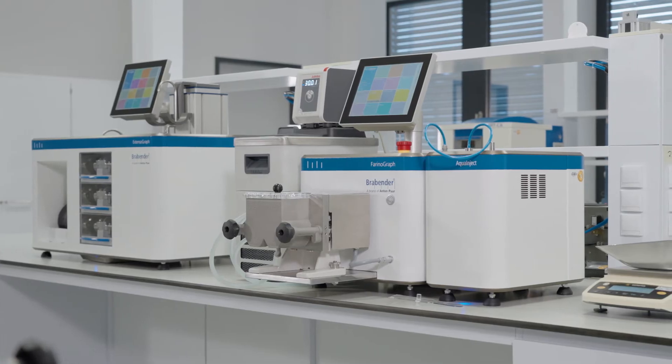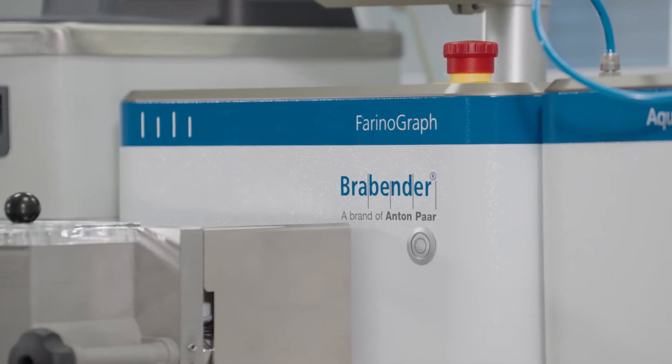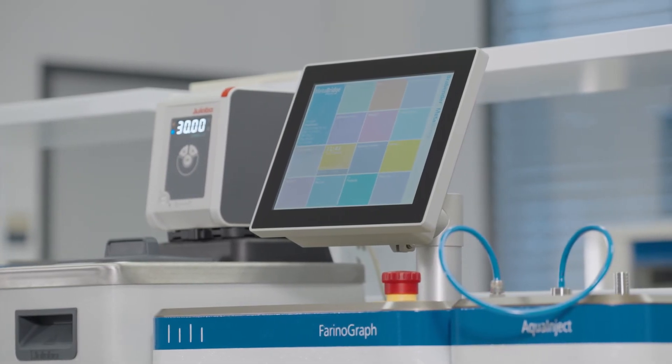In the Brabender world of baking, technology meets passion again. Introducing the new Farinograph Flour and Dough Analyzer. Farinograph — not just a machine, an icon, an assurance.